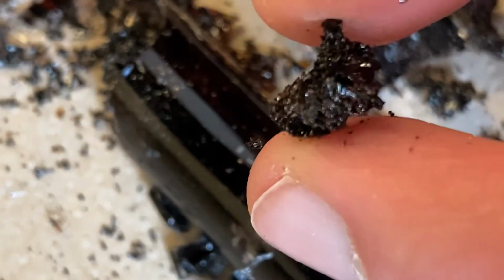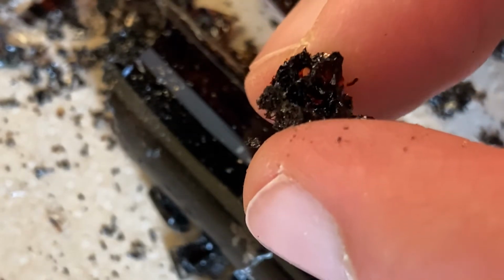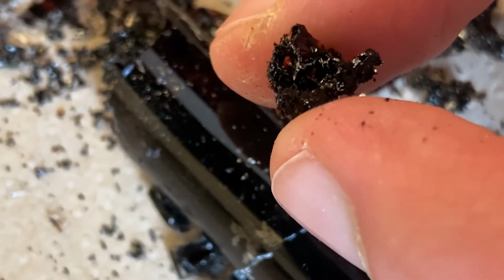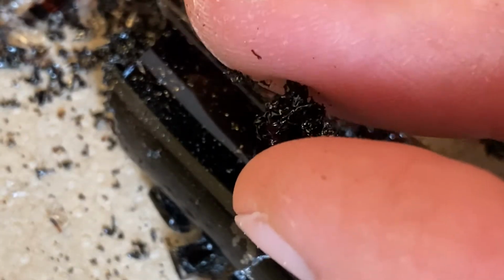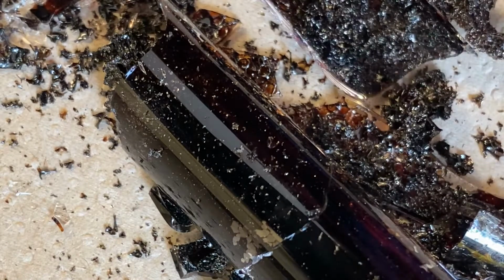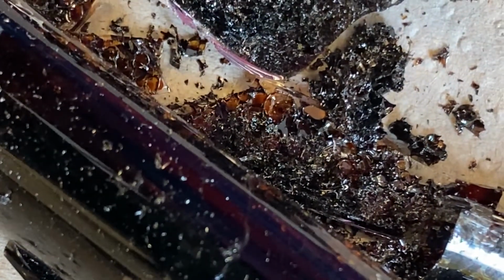You can also see, I can tell you this is very light. This is extremely light. Very flaky, very fragile. In fact, if I just put a little bit of pressure on it, it kind of breaks and crumbles. It doesn't hurt my finger to do so. I'm just wanting to focus more on my fingers than the black stuff itself. Okay, so that should give you a close enough look.